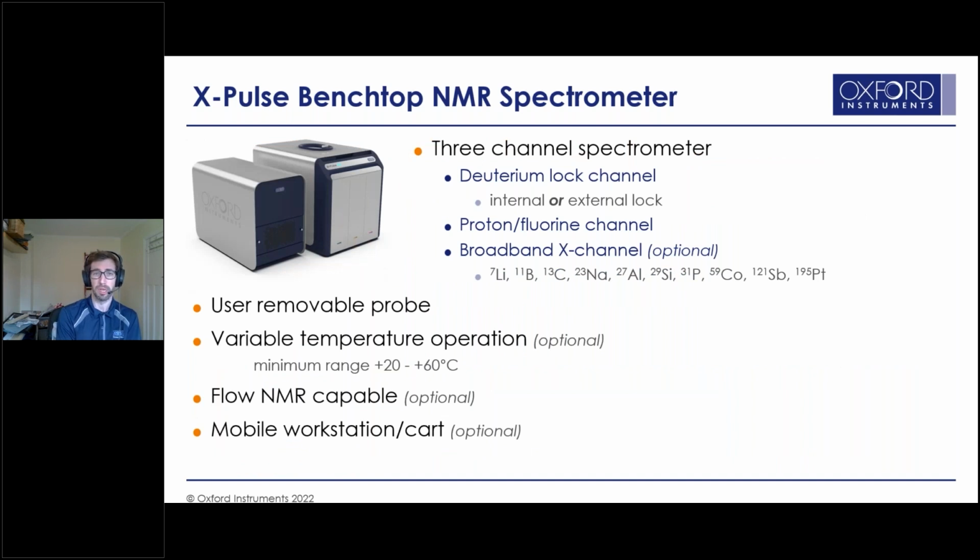The instrument itself is a 3-channel spectrometer. We have a deuterium lock channel, which can provide either an internal or an external lock. We have a proton-fluorine channel, and then we have this broadband fully tunable X channel, so you can analyze whatever nucleus is important for your chemistry.